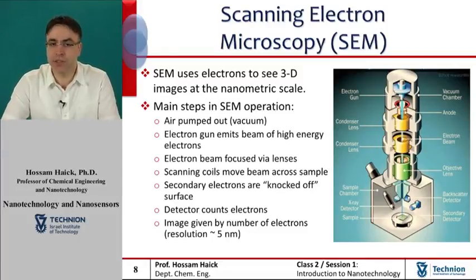In most applications, data are collected over a selected area of the surface of the sample, and a two-dimensional image is generated that displays spatial variations in these properties.